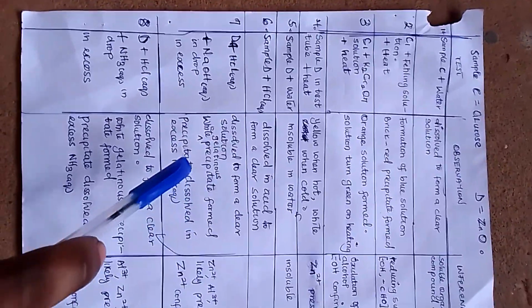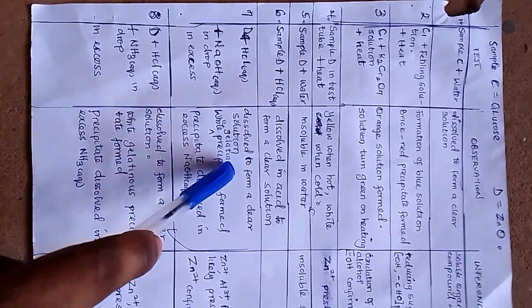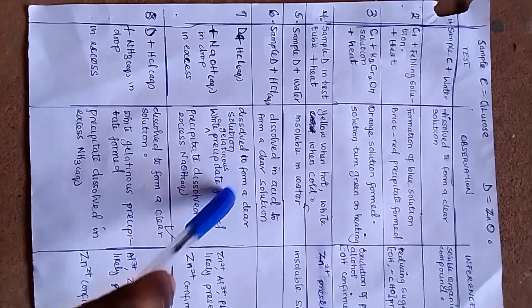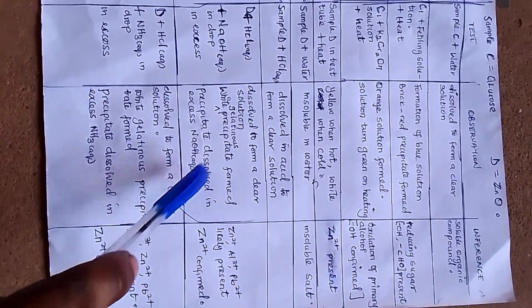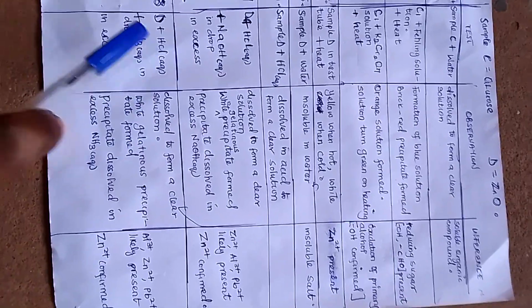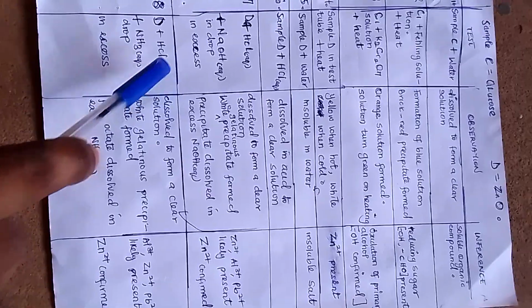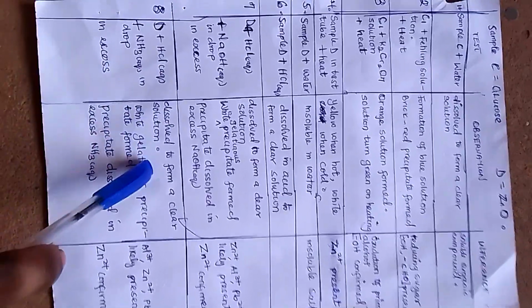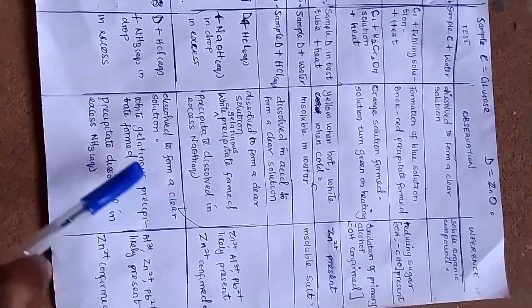And please note, whatever you're supposed to write in the column in front of the excess, don't put it in the drop column, and don't mix the two together. They are separate because there is a separate reaction for drop and a separate reaction for excess. So let's go to the next one. The question might also say maybe sample D plus HCl and then ammonia in drop and in excess. Remember, when you put it in HCl, which is acid, it dissolves to form a clear solution.